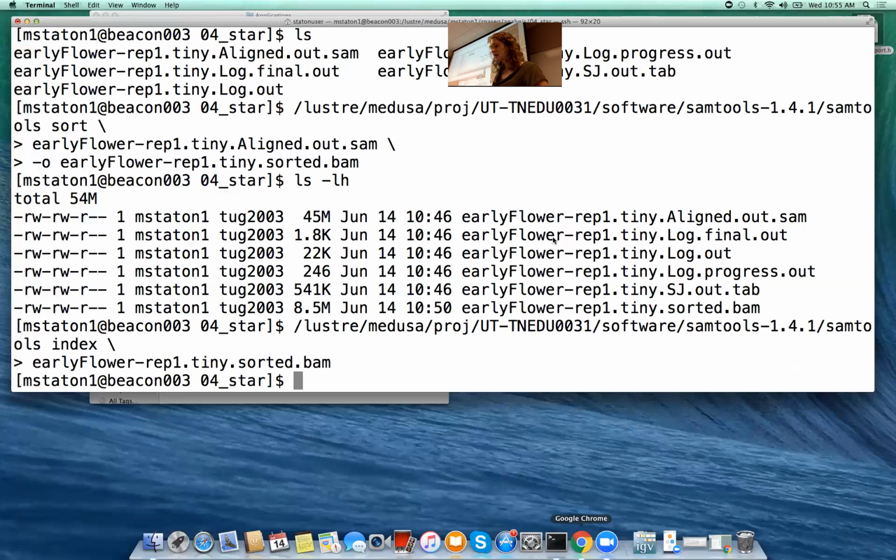So first I'm going to select the GFF3. It says an index file cannot be located, an index file is recommended, and click go to create one now. Okay. I think it's going to load without an index file. I think I tested this earlier. It's not so big that it really needs an index file, but yeah, okay. So it's still loaded. Hopefully you have enough RAM on your computer.